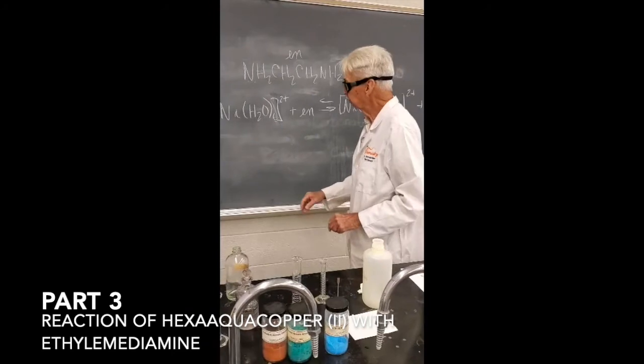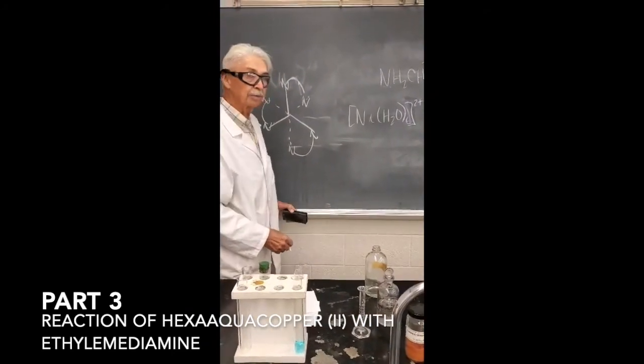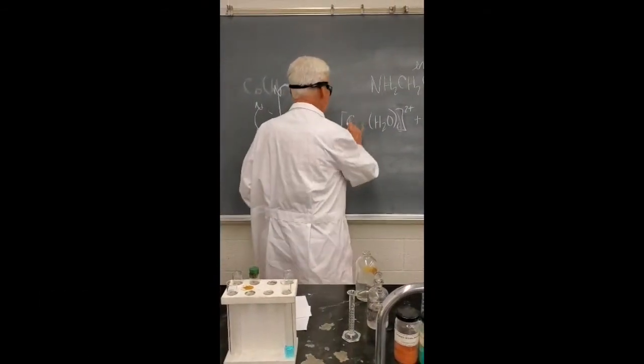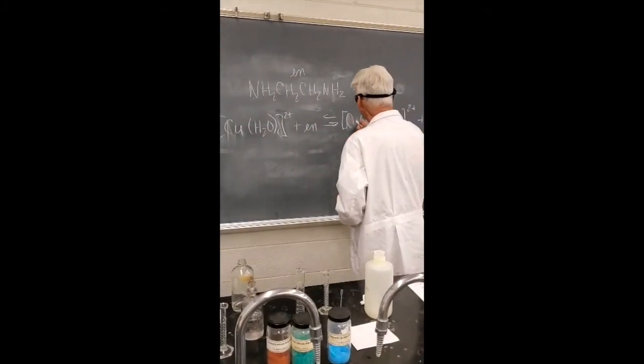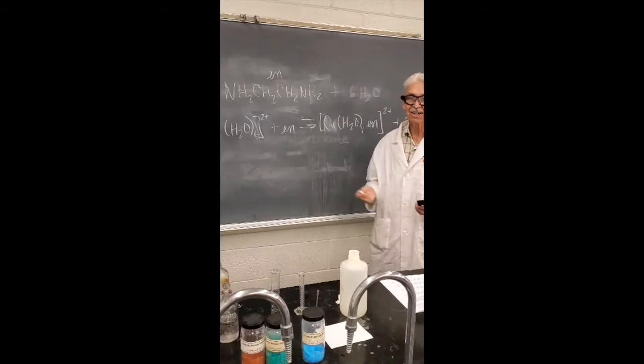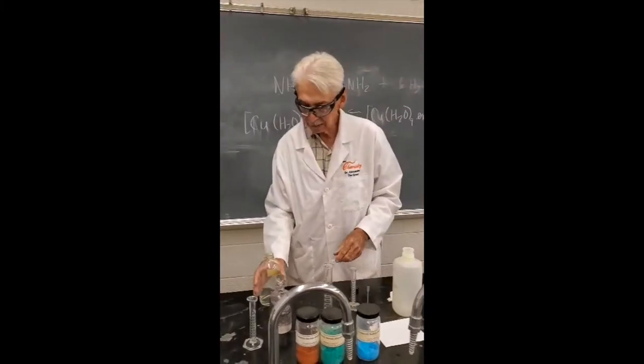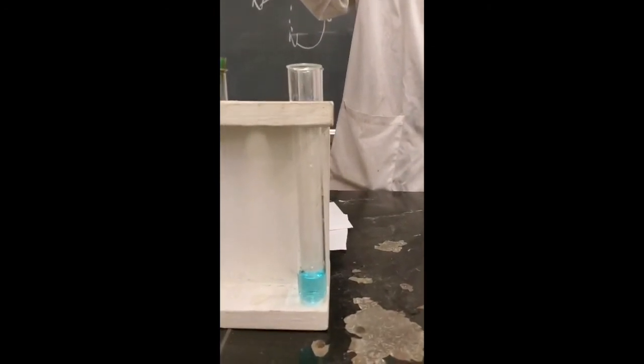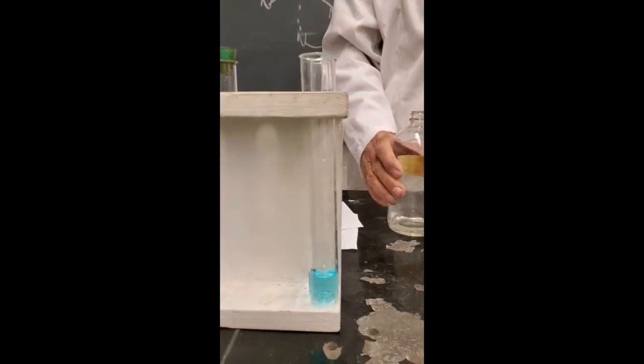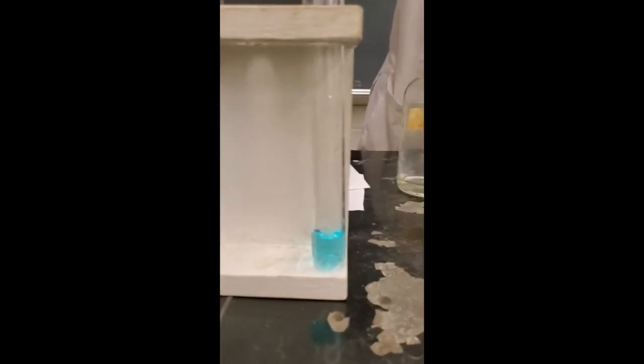I'm going to do a trick here. This is the reaction of one ethylene diamine with copper. Ready? That's cheating, isn't it? Same reaction occurs except the metal ions are different. The colors are going to be different. So let me measure an ethylene diamine here. I'll take one milliliter and pour it in there. See if you see any evidence of color change. Any evidence of color change? Isn't that pretty?